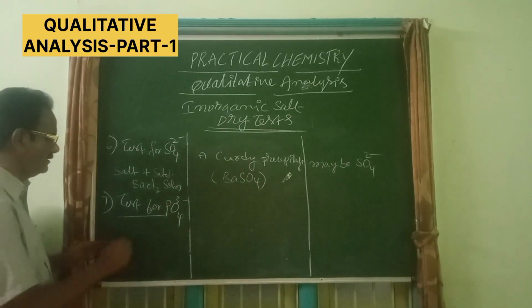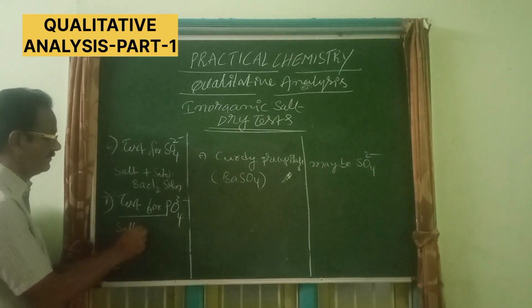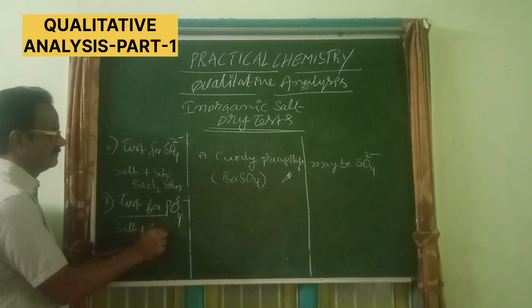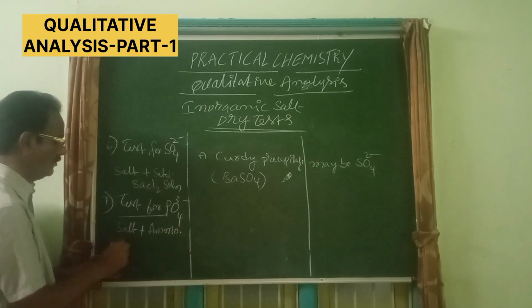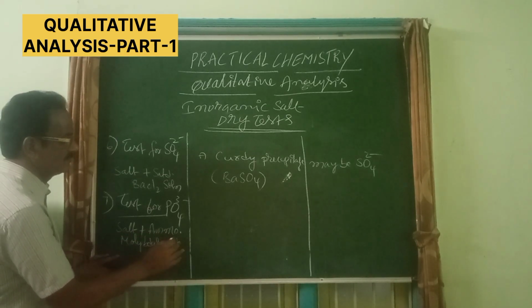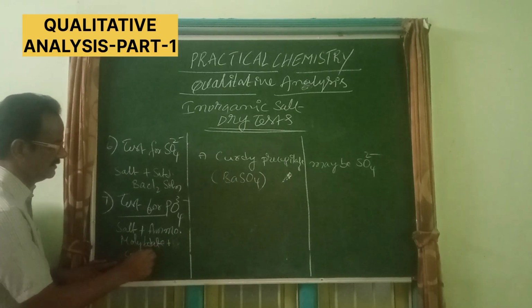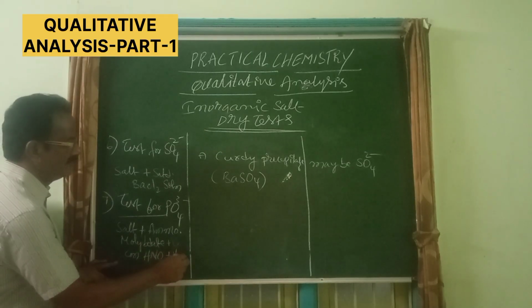Here the test is to be conducted like this: salt plus ammonium molybdate solution plus concentrated HNO3 and then subjected to heating.